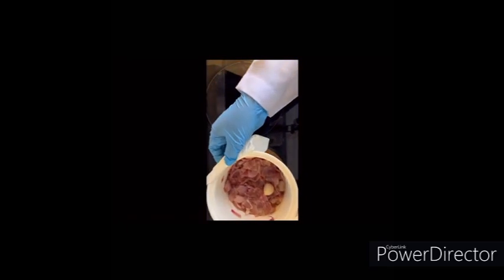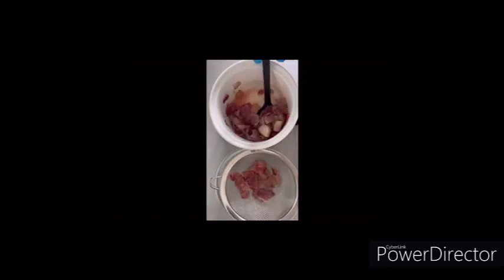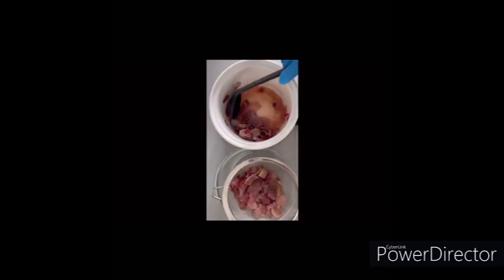Next, boil the materials for 10 minutes and stir occasionally using a glass rod. This is the fast-forwarded video of the 10-minute process, where the color of the extract changes from clear to a darker color. Remove the beaker from the heat and allow it to cool down while soaking the onion for 30 minutes to avoid overheating and the loss of anthocyanin pigments. Finally, using a sieve or preferably a filter paper, filter the onion pieces from the onion extract by pouring it into the filter or sieve.